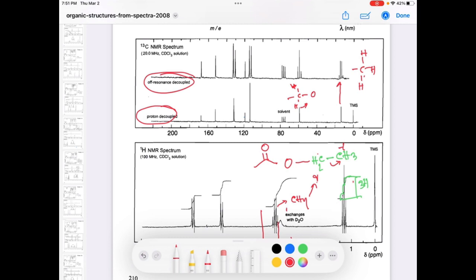In the aromatic ring, we have a benzene ring, and we are saying it is 1,4-disubstituted. So let's count the types of carbon. It will be 1 carbon, and then another carbon. These two will be the same, and there will be another carbon.